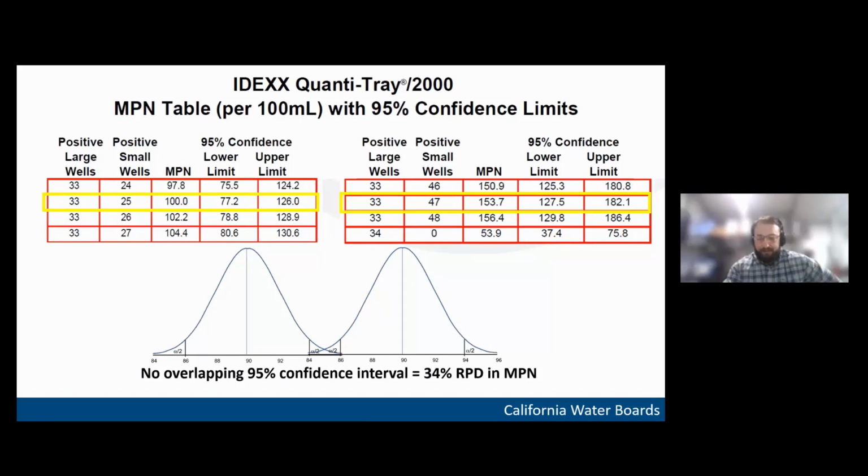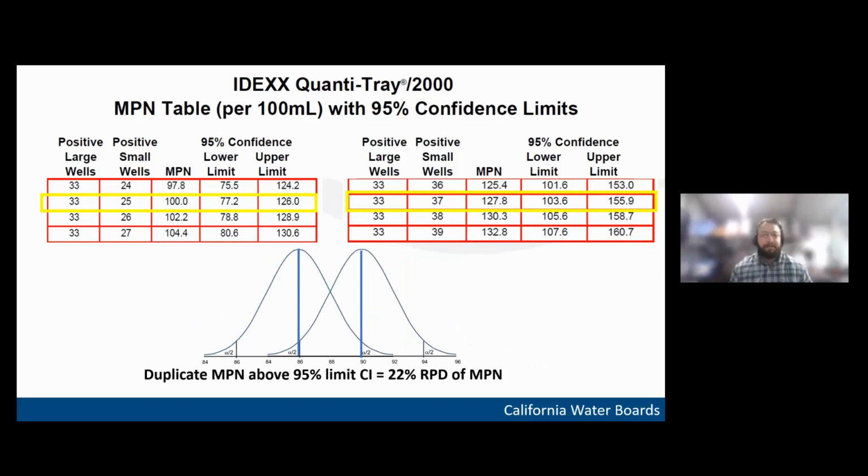We wanted to get a little bit more in depth than that. And you can see for one sample that has an index value of 100, running the same sample would have to give you an index value of 153 before they were considered not precise enough. Now, again, that's not good enough for us, and I'll get into how we calculated that.